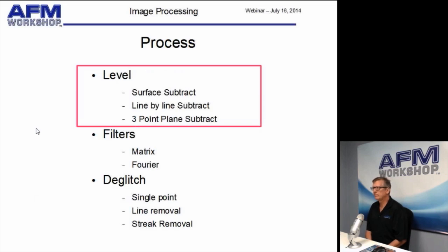So today, I'm going to talk about the first topic here that's in the red box. That's the leveling functions. There are other functions for processing, filtering and deglitching. You can learn about those from the Gwyddion website.